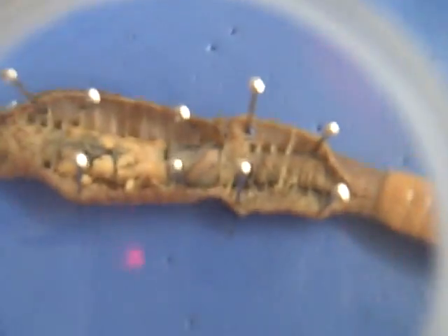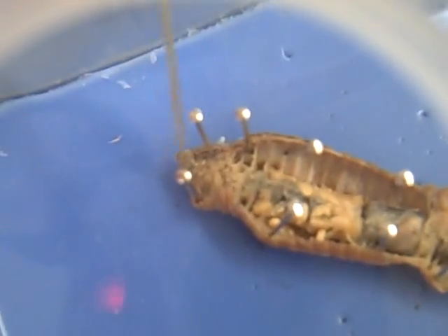Hello, this is Erin and Grant's worm dissection. Starting with the mouth, this is the mouth right here.